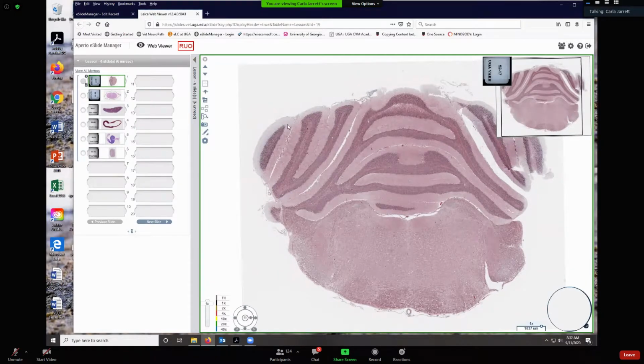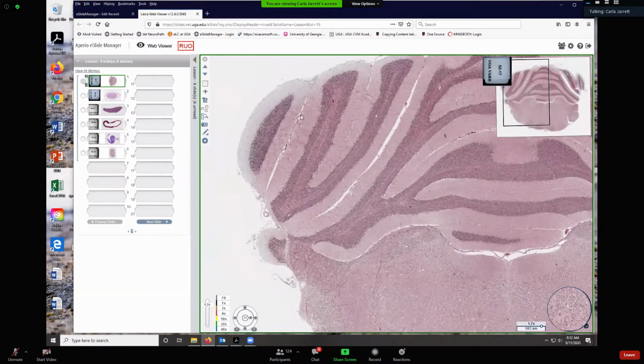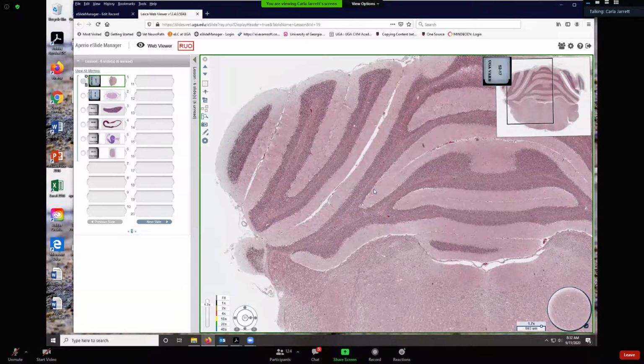So we go up and down into a sulcus and then come back up and down into a sulcus. So from this sulcus to this sulcus right here, there's not a lot of space in that sulcus. Then this width right here would be one folium. So this is a folium right here. Now these folia give the cerebellum a lot of increased surface area.